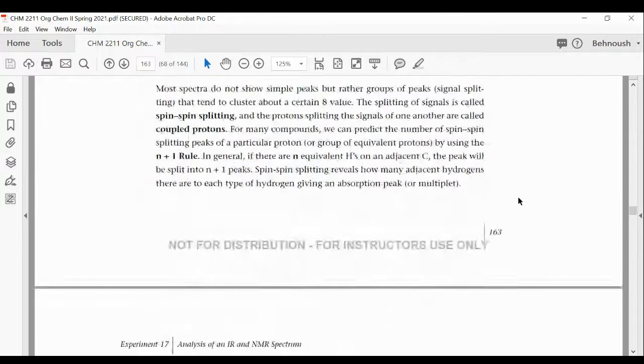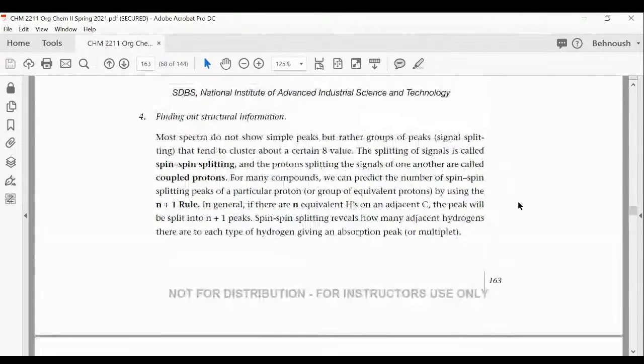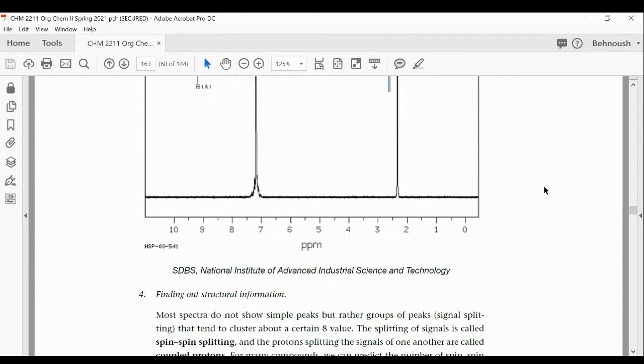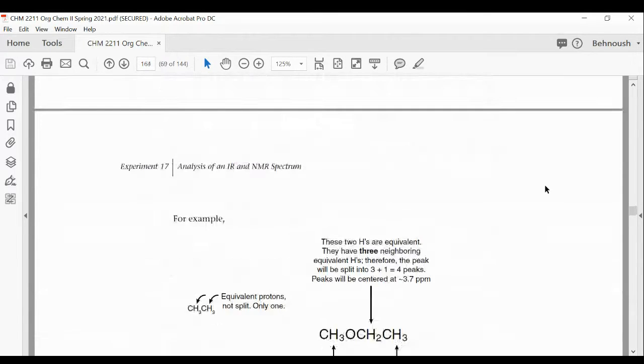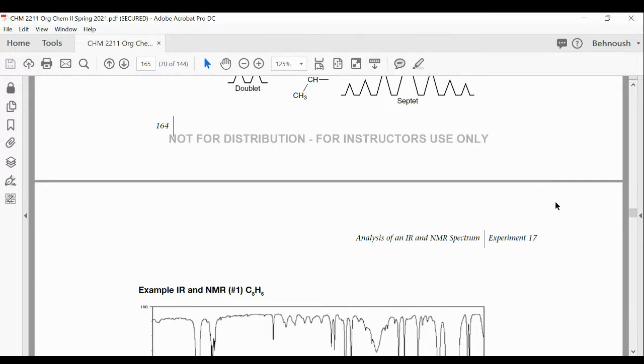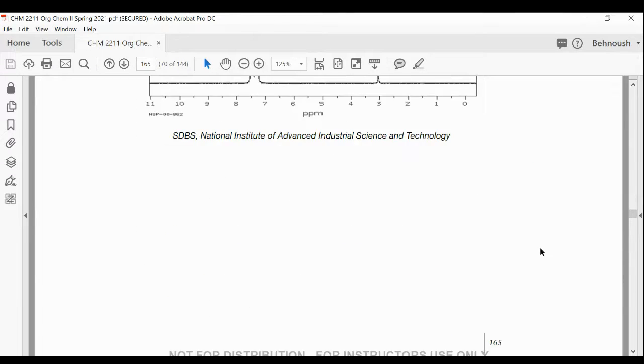Any questions? Is it always whole numbers, no decimals for the ratios, to keep it simple? It's the ratio, but it's not always a whole number. Maybe you would have a 0.5 height, but 0.5 represents 1 hydrogen. Then every 0.5 in the height represents 1 hydrogen. Okay, thank you. Yes, you're welcome. But the ratio is always a whole number ratio, or you can multiply to make it a whole number ratio, to make it simple. Because we don't have half hydrogens. If you find a ratio of half, then you make it a whole number because you're counting the number of hydrogens.